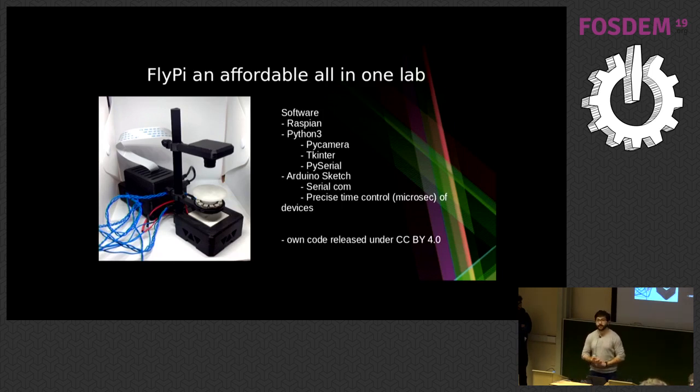Yeah? How difficult was it to get focus on new microscopes? Not very hard. So the question was how hard it was to get focused on the micrometer range. So it wasn't very hard. As soon as we found the proper M12 lens, and I think this one has like a 6 millimeter working distance characteristic, we just needed a stable 3D printed surface where we could slowly move the thread of the camera and the object.